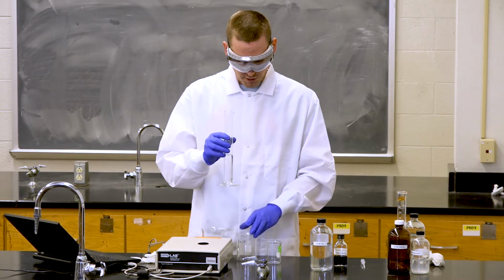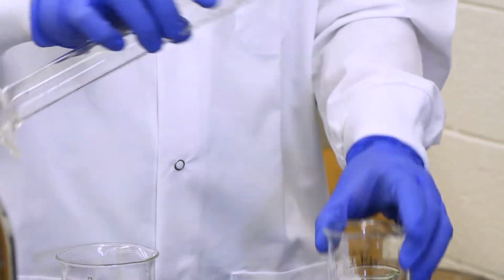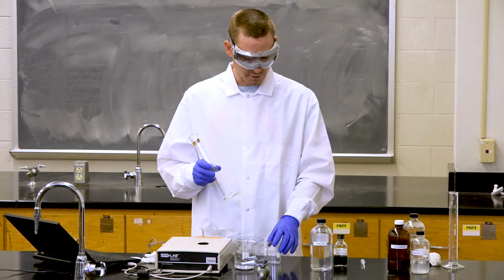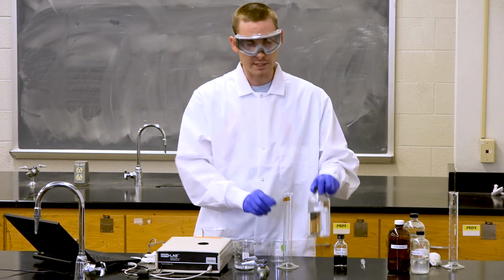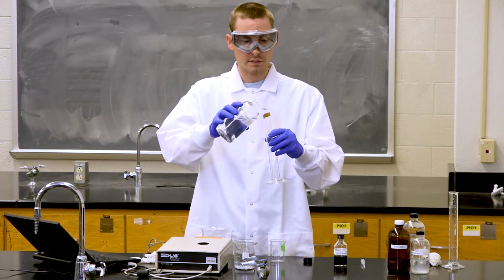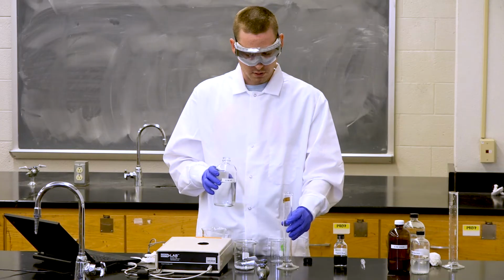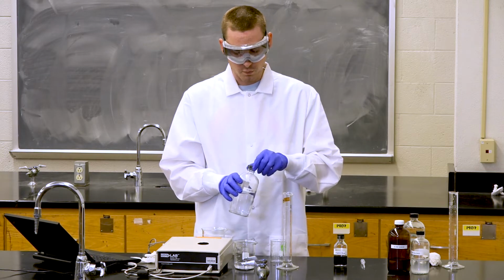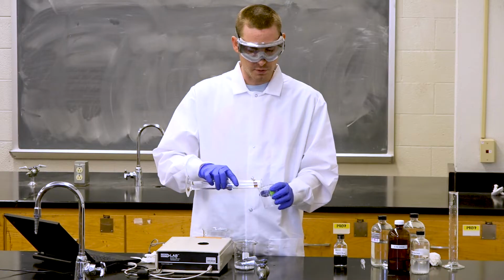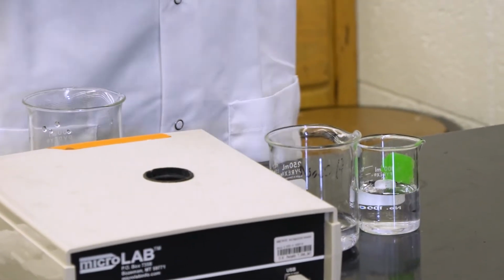Once we have done that, we can pour it into a beaker and set it aside until later. And then using another graduated cylinder, or after you've cleaned out your previous graduated cylinder, you can do the same thing for hydrochloric acid by adding 5 milliliters of hydrochloric acid to your graduated cylinder, and then diluting the acid with water. We can then pour this solution into another beaker and then begin to measure each of their conductance.